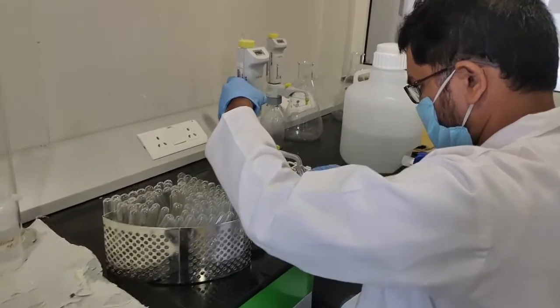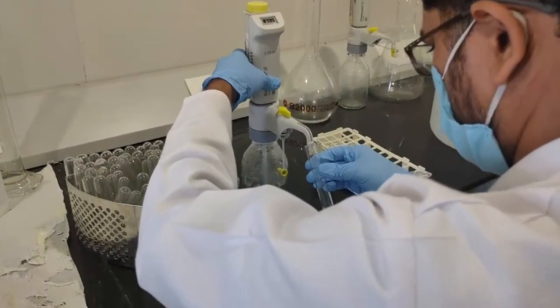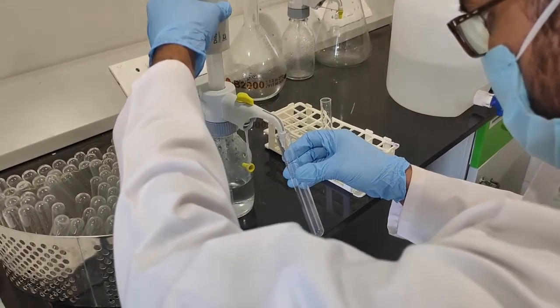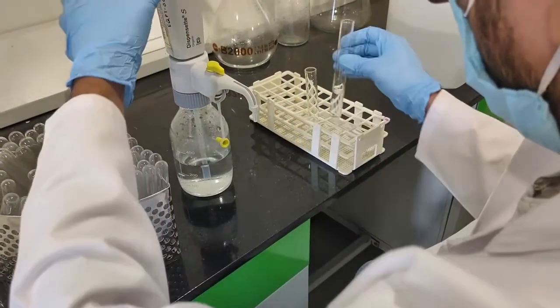Prepare 500 ml to 1 liter of 0.9% normal saline. Distribute 9 ml or a little more into each tube. Care should be taken that a minimum of 9 ml ± 0.2 ml remains in each tube after autoclaving, which is required for serial dilution.